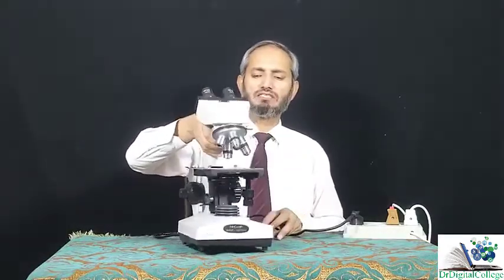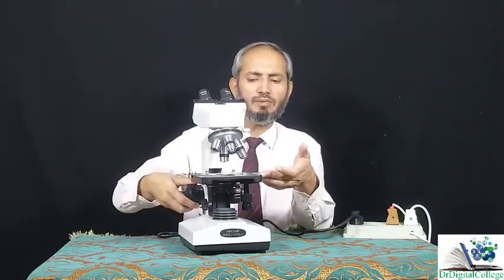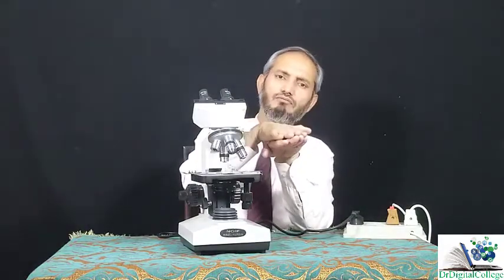What is meant by locking the stage? It means that your stage can now move down. Look at this, it is moving down, but it cannot move up beyond the specific level where you have fixed it.